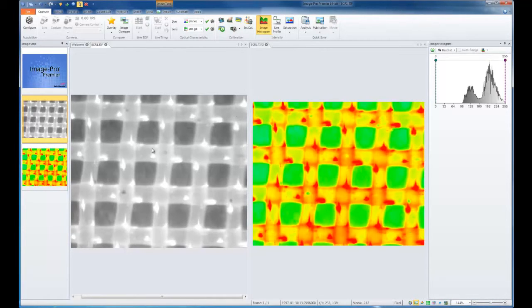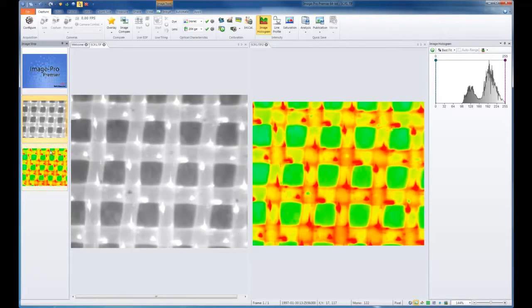For each image that I want to look at, I may want to lock to a companion image. To do so, I'll select both images in the image strip, clicking the first one, holding down Control, and then selecting the second one. Both highlight as now the active images.